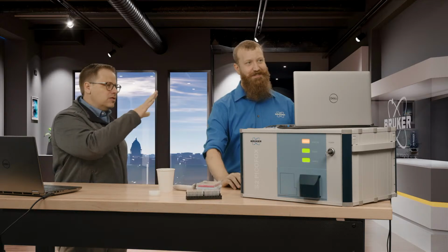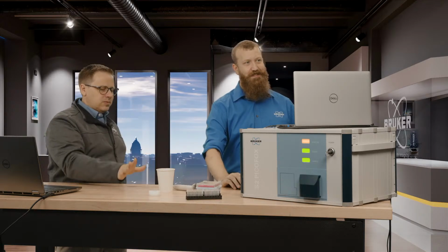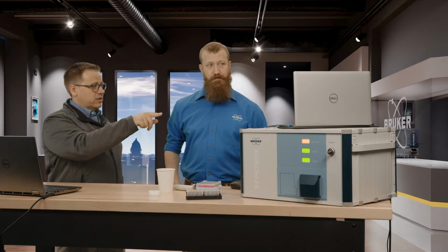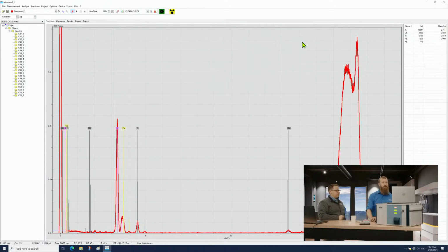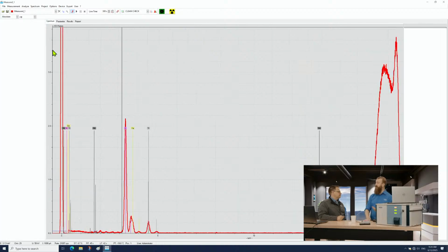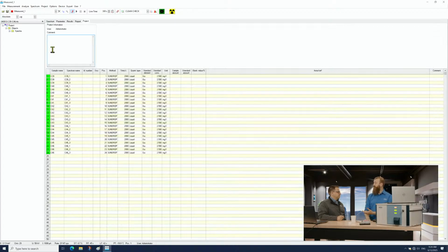So now this was a qualitative example. Like you said, we didn't spike it at all, so we didn't have a known. Yes. But you do have an example of something that is a quantitative example we can look at, right? I do. Just recently I did a test of bromine in soda because the FDA recently banned the use of brominated vegetable oils in soda. So I did a whole bunch of these and I just went and bought every single soda I could get my hands on at the grocery store.